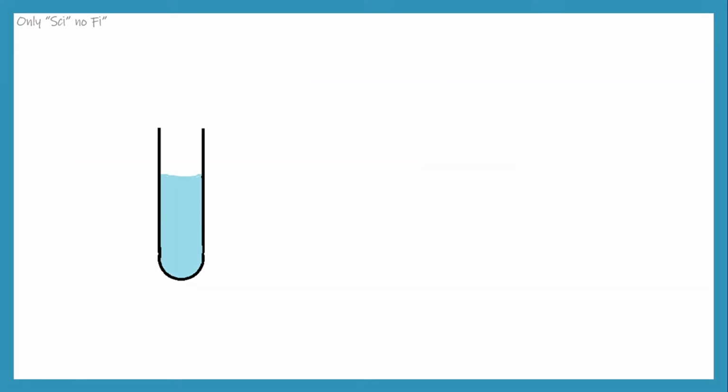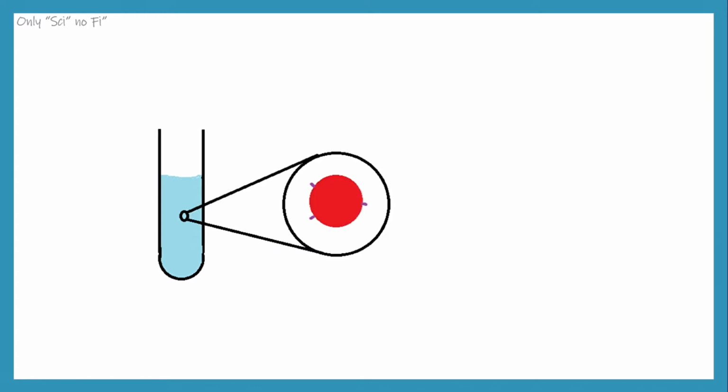Now, suppose you have a mixture of cells. Firstly, you want to identify a certain type of cell or you want to sort them. That is, this is a specific cell which you want to isolate or sort from the other types of cells present in the mixture. Now, for example, this is a certain type of protein which is expressed.